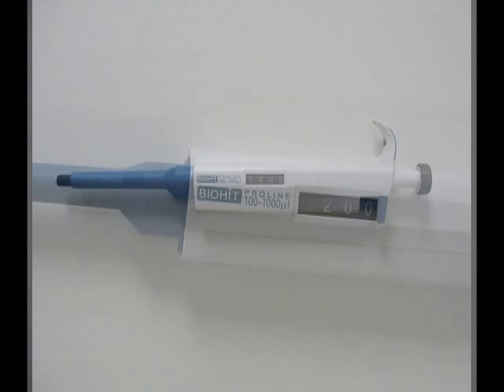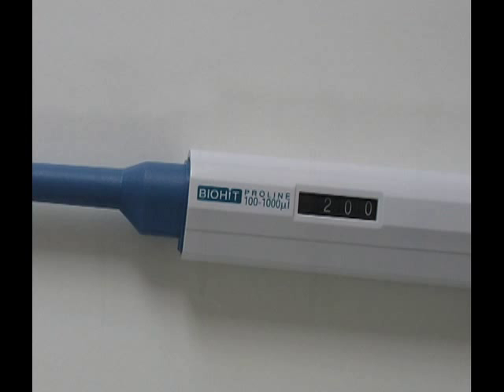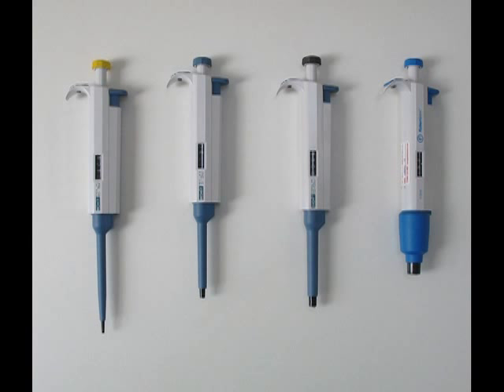To ensure a diverse range of volumes can be manipulated, multiple pipettes with different volume ranges are used. For example, this set of four pipettes can accurately dispense from 0.5 microliters up to 5 milliliters.